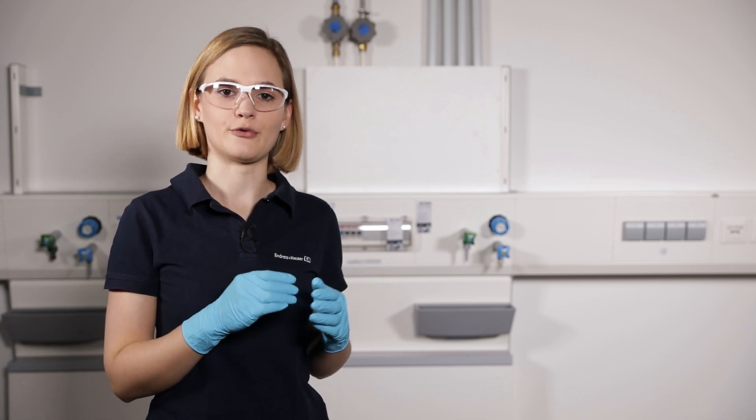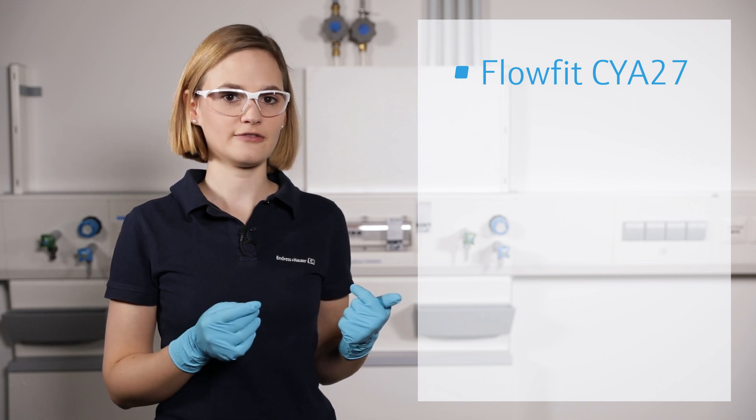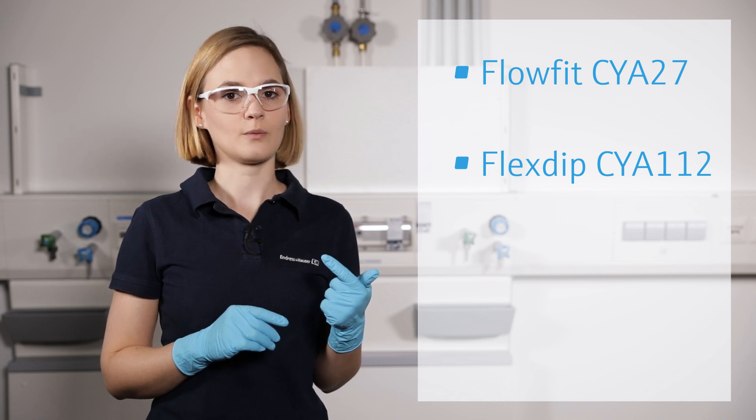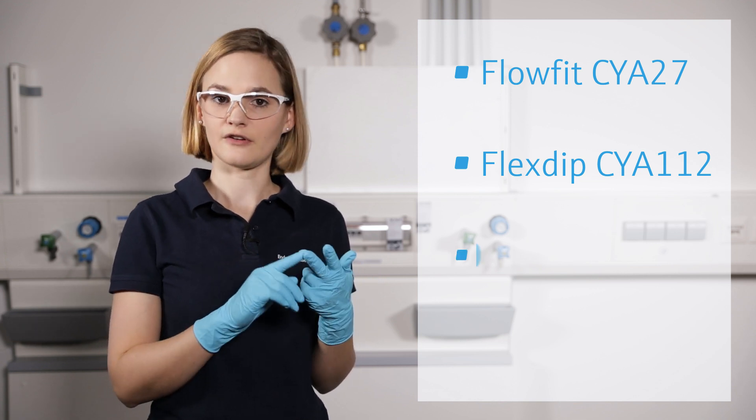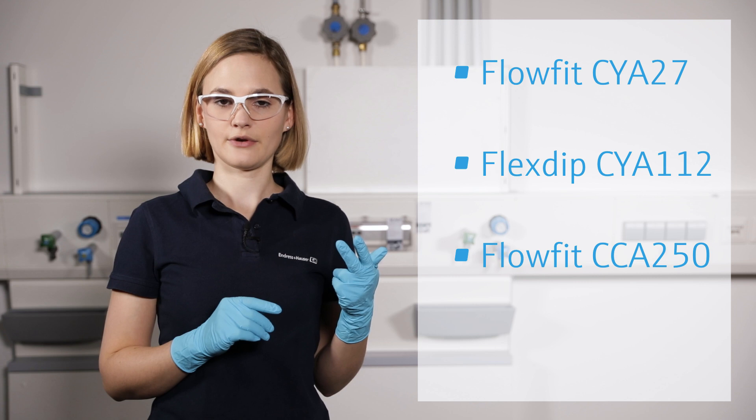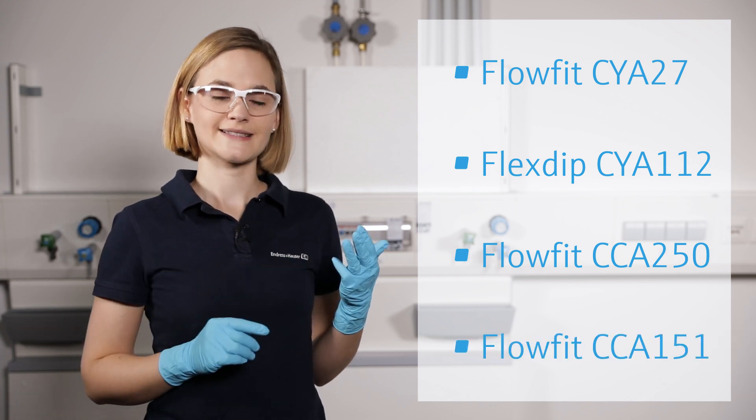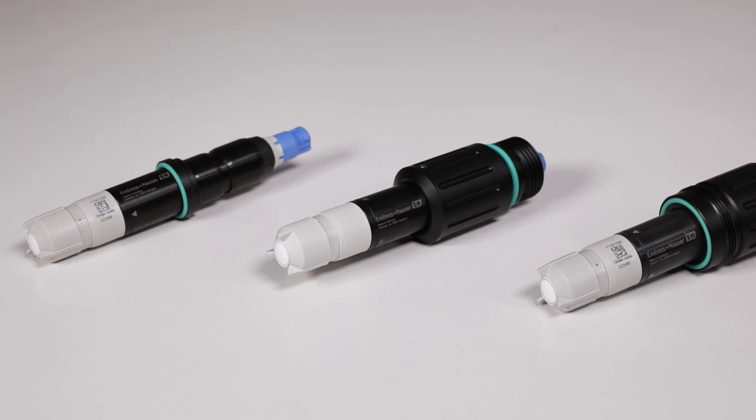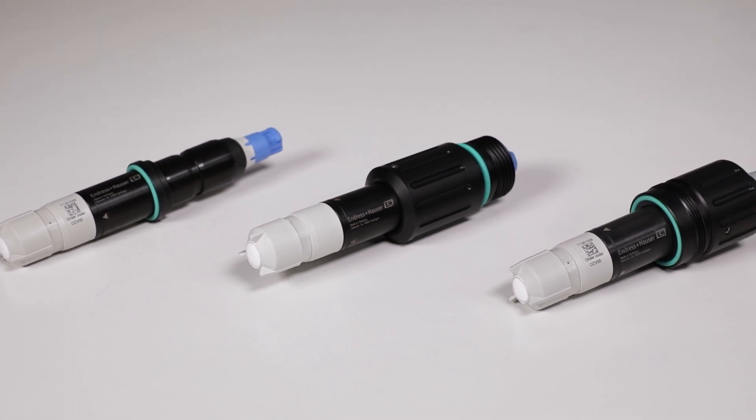The sensor needs a certain flow against the membrane and therefore it must be installed into one of the following assemblies. It must be installed in the Flowfit CYA27 or alternatively it can be installed in the Flexdip CYA112 on one of the previous assemblies, Flowfit CCA250 or Flowfit CCA151. For each assembly a different mounting adapter is necessary. The correct adapter must be chosen in the order code of the CCS51D.